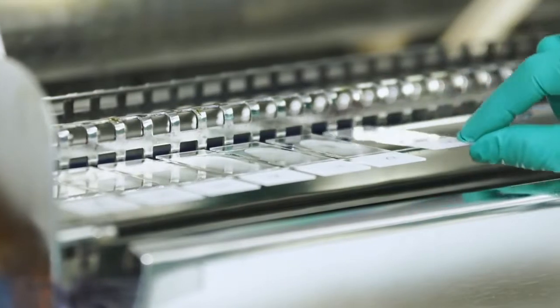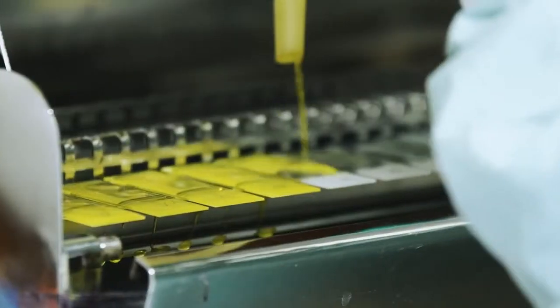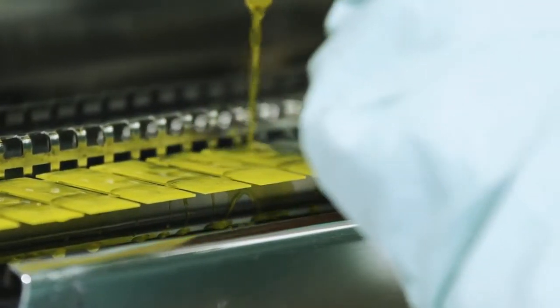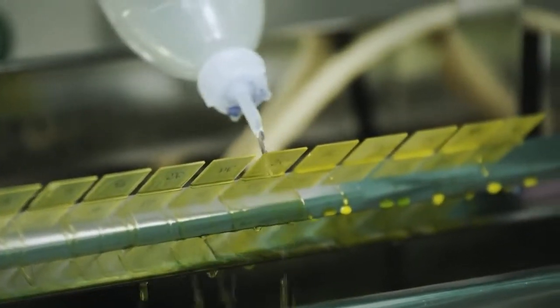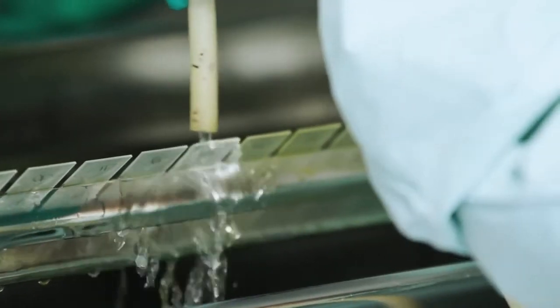For staining, use a solution with auramine O that settles in the cell wall of bacteria. Keep the preparations covered with solution until the end of the 20-minute staining time. Non-acid fast bacteria fade when you subsequently treat them with a mixture of acid and alcohol, whereas acid-fast tuberculosis bacteria retain the stain. Rinse the alcohol off thoroughly with distilled water.